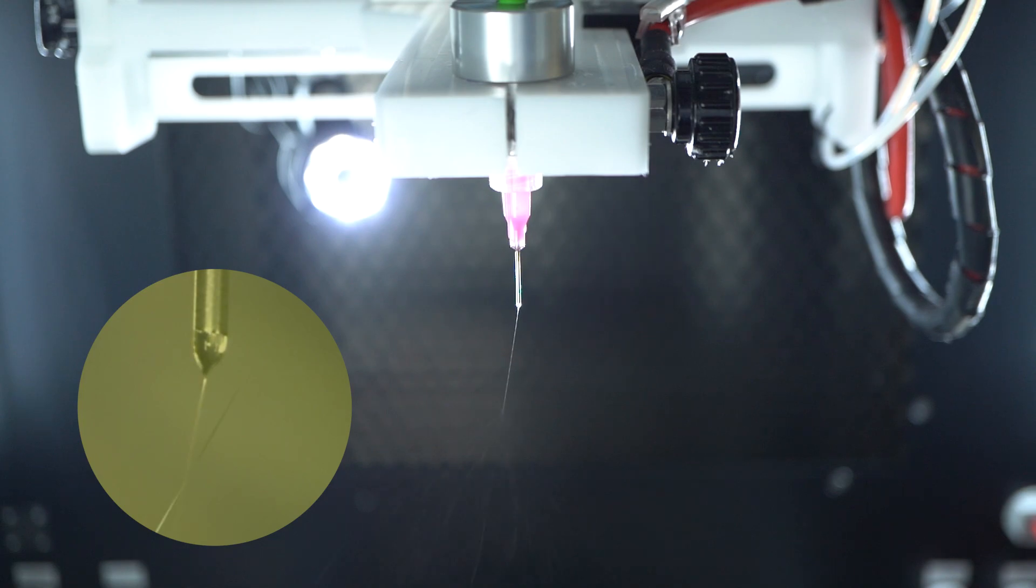For more information on what an optimized solution looks like, be sure to check out our upcoming video on important electrospinning solution parameters.